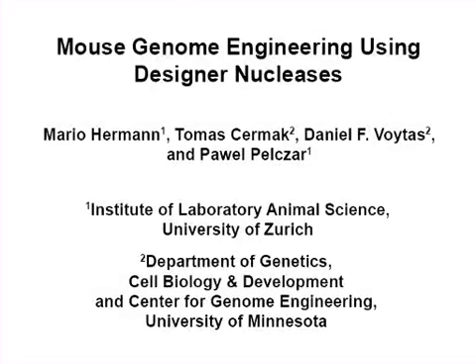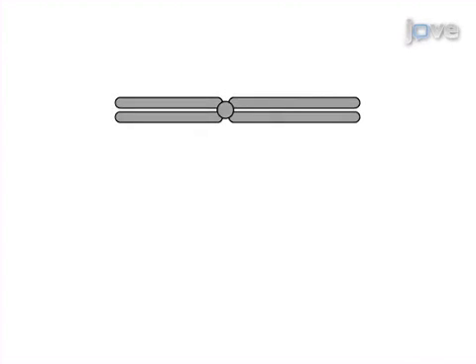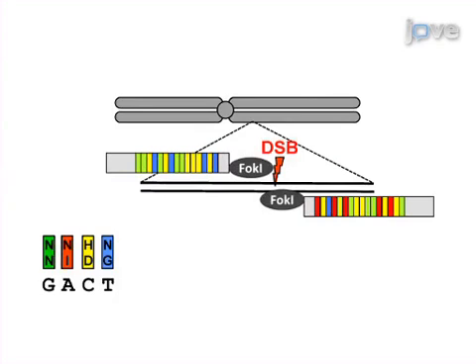The overall goal of this procedure is to rapidly generate gene-deficient mice with the help of designer TAL effector nucleases, or TALENs. This is accomplished by first designing and assembling DNA constructs encoding specific TALEN pairs, which serve as templates for in vitro transcription to generate TALEN mRNAs.